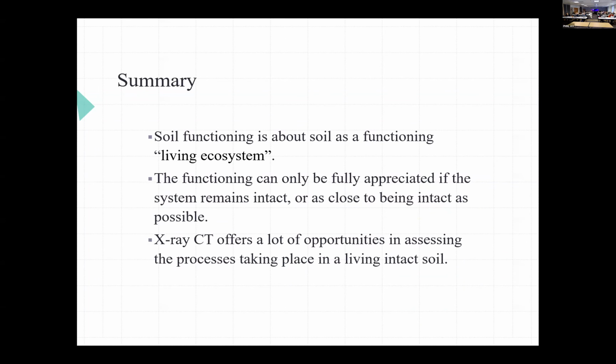And so that brings me to my summary: soil functioning means looking at the soil as one whole living ecosystem, and we can only appreciate that functioning if we keep it as close to intact as possible. And it's great that we now have X-ray CT that enables us to do that.